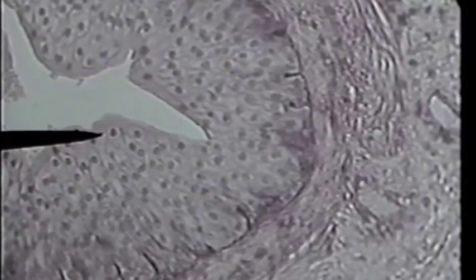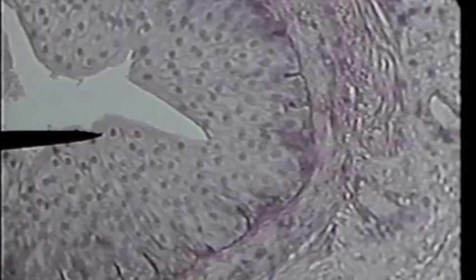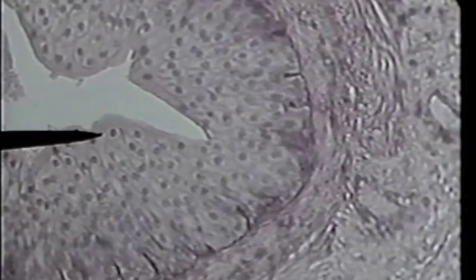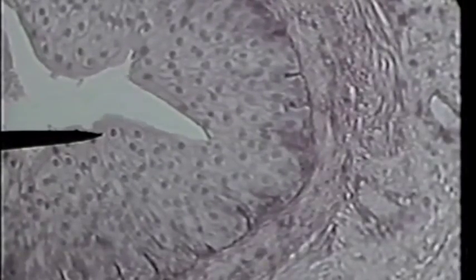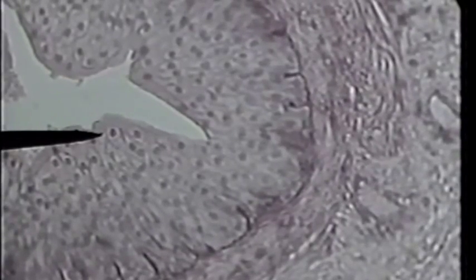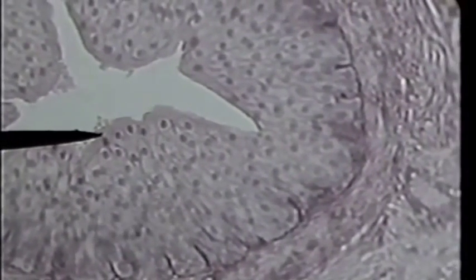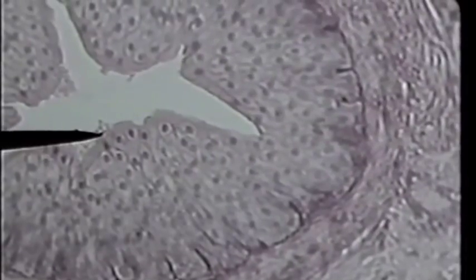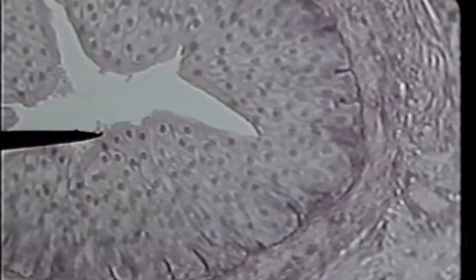There is, in addition to the transitional epithelium that we're seeing here, a mucus layer lying on top of those cells or between the transitional epithelium and the lumen. It is a homogeneous layer. You don't see nuclei in it or cell boundaries. It is just simply a layer of mucus. The tip of the pointer now is pointing to that homogeneous layer of mucus.